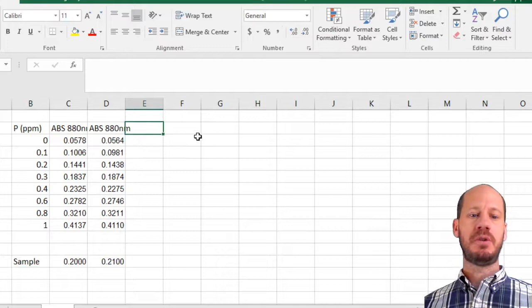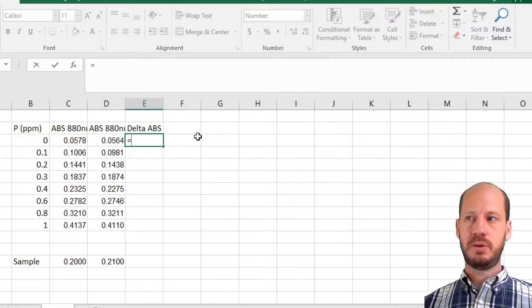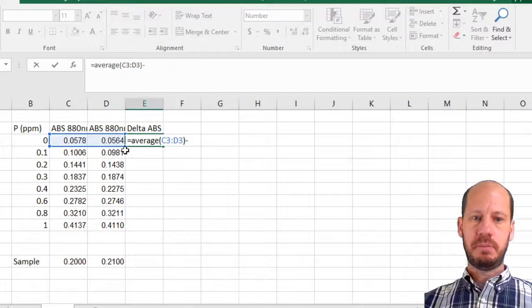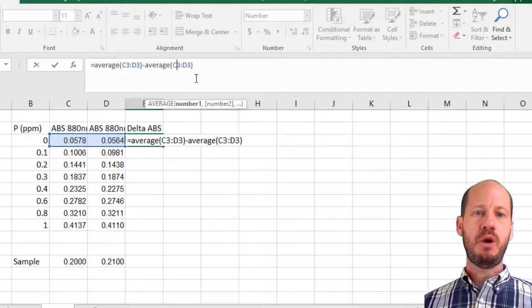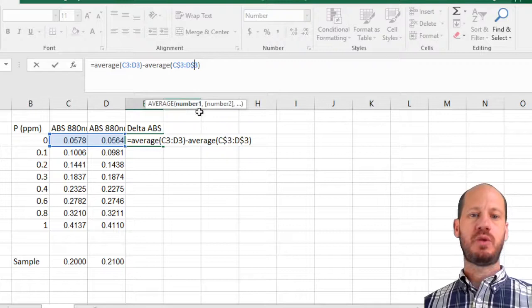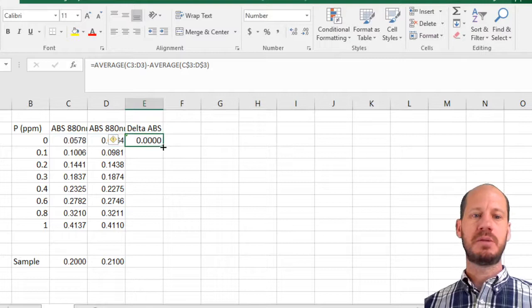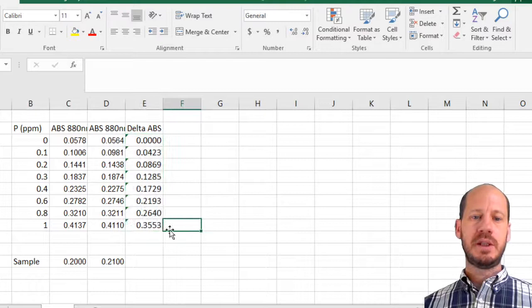First we calculate the delta absorbance. The formula is: average of the zero blanks minus the blanks itself. This will become zero. Now you fix the subtraction so you're always subtracting the blanks. The dollar sign means that when you drag this formula around the spreadsheet, it will always be subtracting the zero. Because the zero still has a small amount of absorption, you have to subtract it from all your samples.